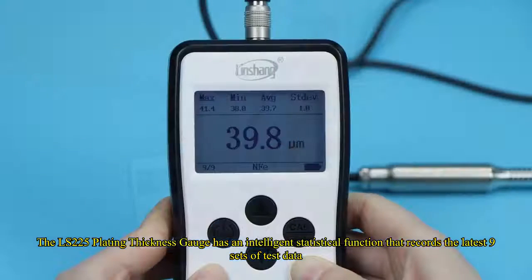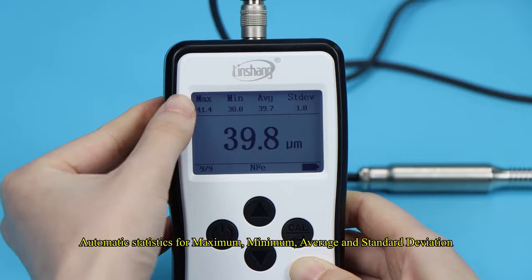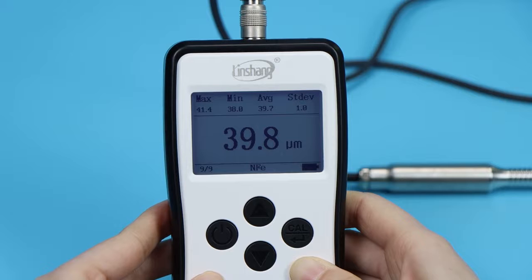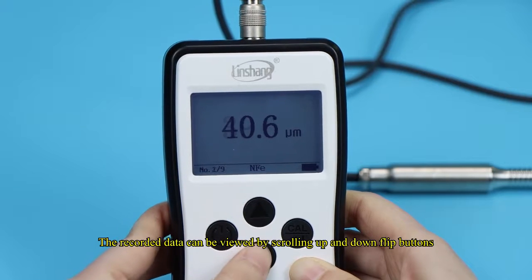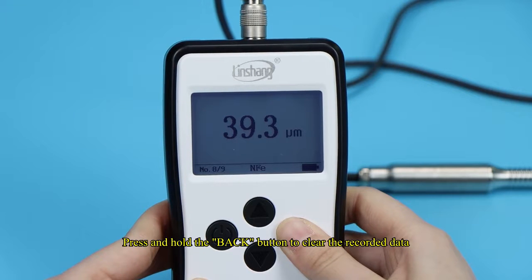The LS-225 plating thickness gauge has an intelligent statistical function that records the latest nine sets of test data, with automatic statistics for maximum, minimum, average, and standard deviation. The recorded data can be viewed by scrolling with the up and down flip buttons. Press and hold the back button to clear the recorded data.